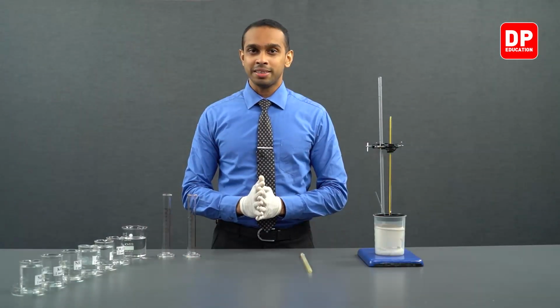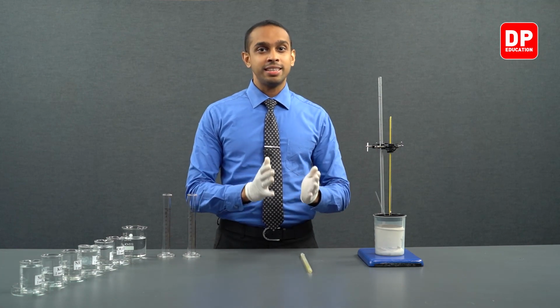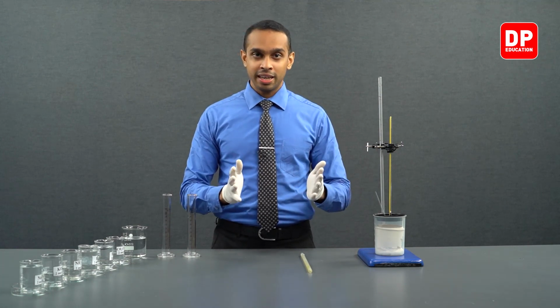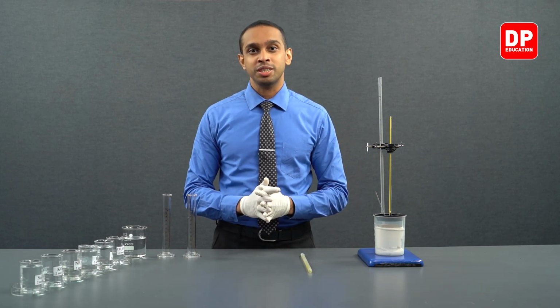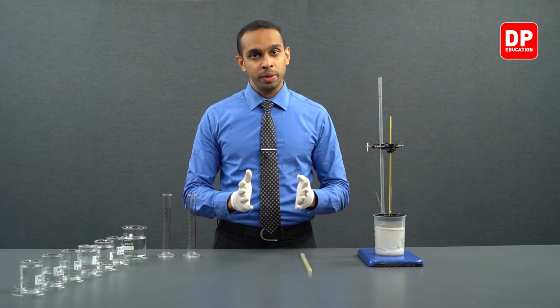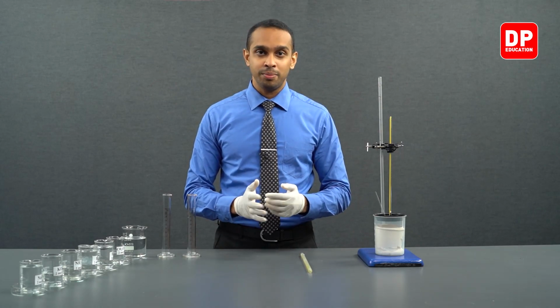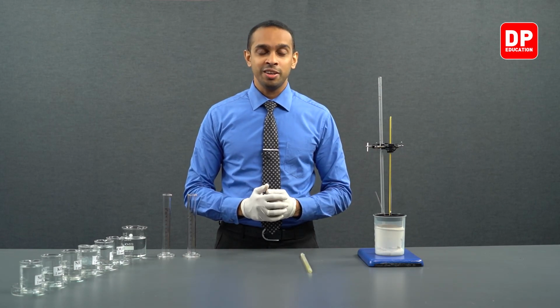Now, let's move on to identifying the equipment and the reagents we will be using for this experiment. In this practical, the basic idea is to react an acid with a base and measure the highest temperature that particular reaction mixture reaches. So, for this purpose, we will be using a variety of acids and bases. Let's identify the bases we will be using for this practical.